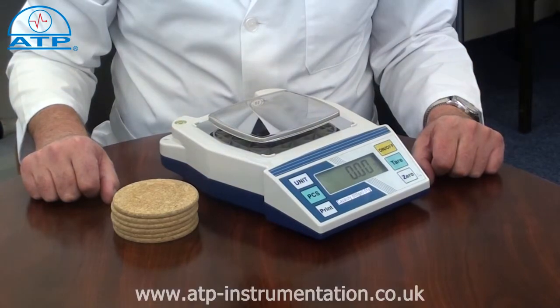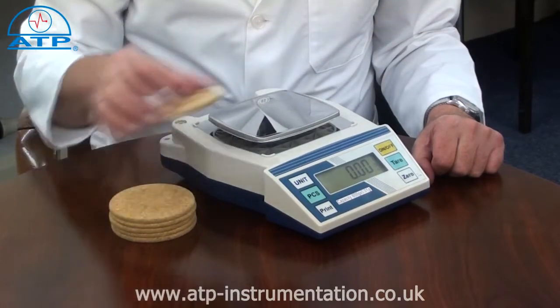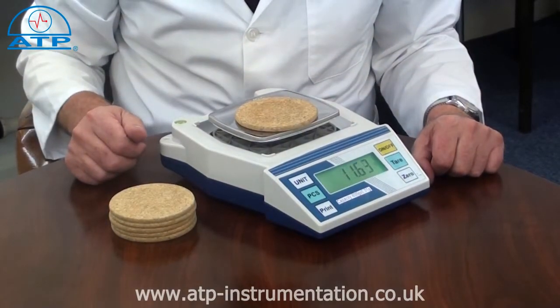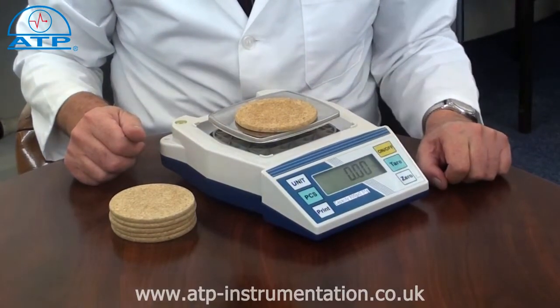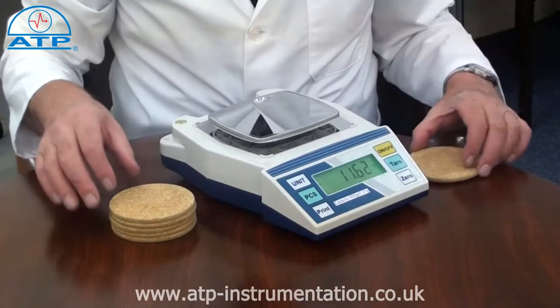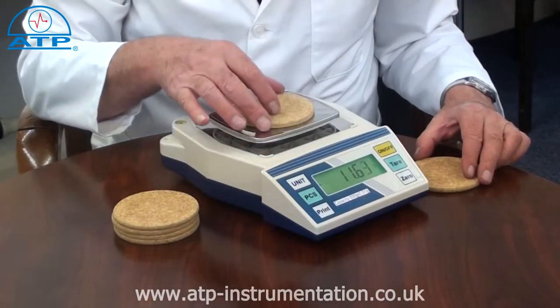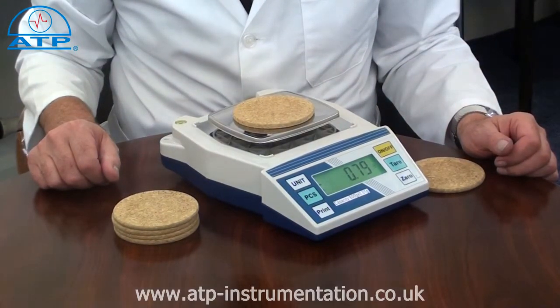Plus or minus wear is ideal for quality control applications such as sample cross-checks. Simply place a sample product or a calibration weight onto the platform, press tare, and the display value will be zero. Remove the sample or weight and place another sample on the pan. If there is a difference in weight between the two samples, the displayed value will be the difference, shown as a plus or minus value.